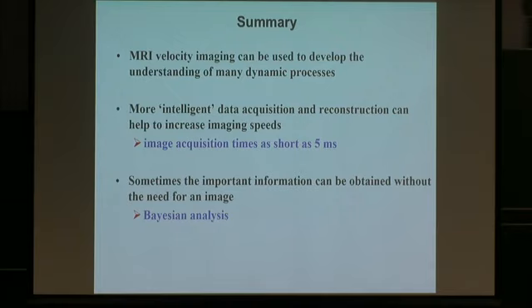And also, following on that theme, can we actually acquire fewer points but not worry about an image, and think about other types of data analysis, again, probably with some prior knowledge of what system it is that we're looking at. Thank you.